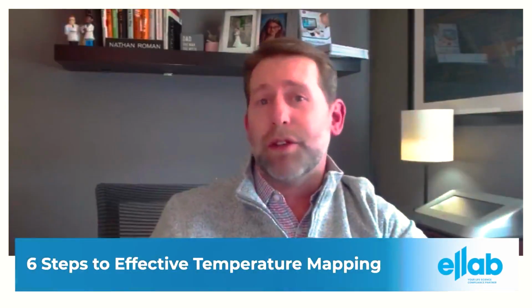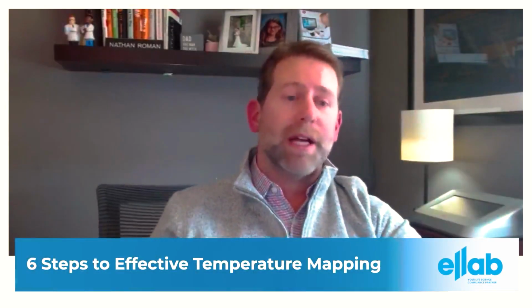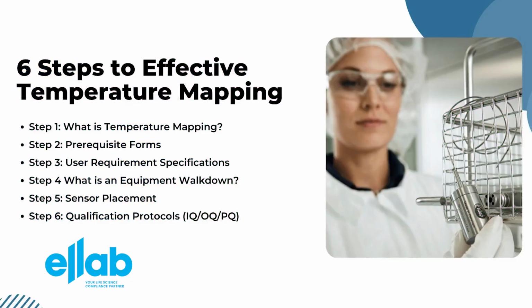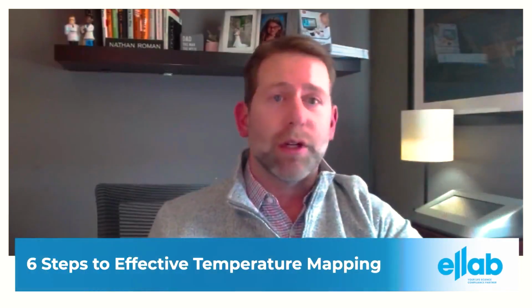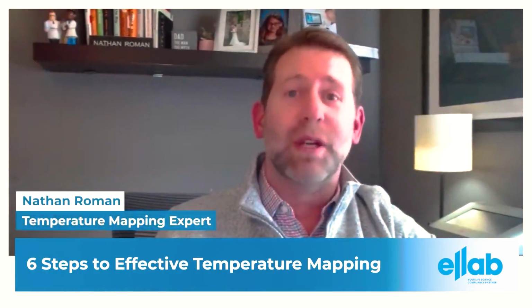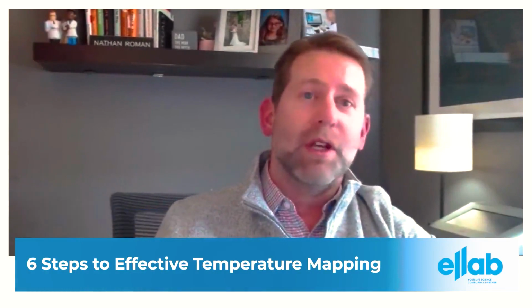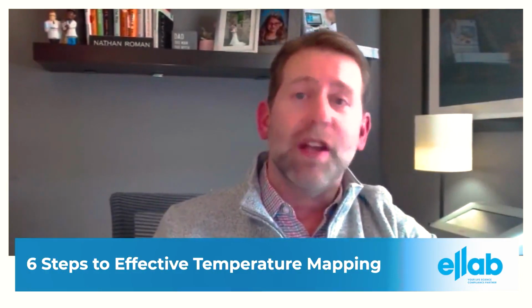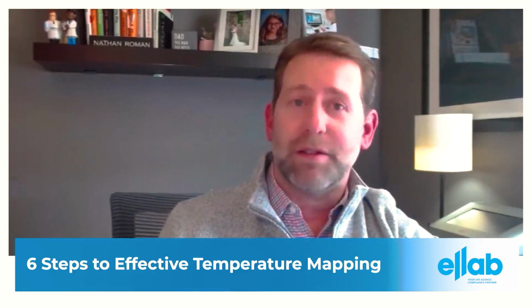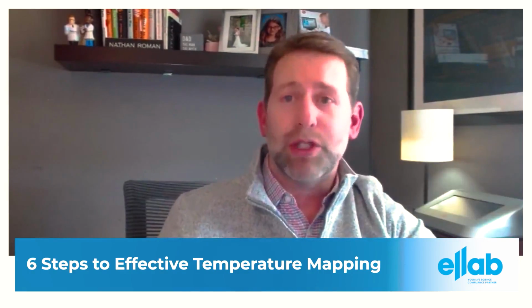In this session, we've covered the foundations of temperature mapping by walking through the 6 steps to effective temperature mapping. From defining temperature mapping, gathering critical data, to inspecting equipment, and validating the system. Each step provides a robust framework to ensure compliance and quality. It's fascinating to see how these 6 steps come together, from defining temperature mapping to those rigorous qualifications. It all builds a framework for ensuring those products are safe and effective. It really highlights how important a systematic approach is to temperature mapping.